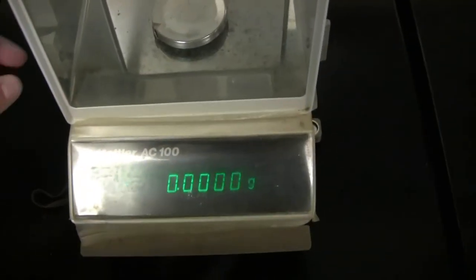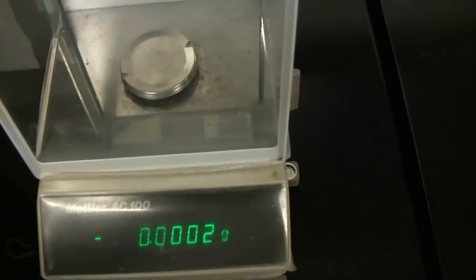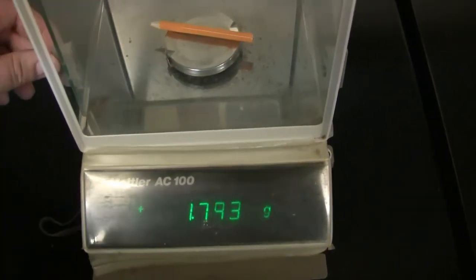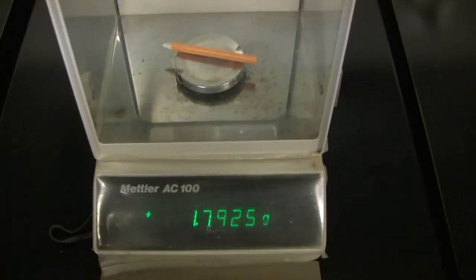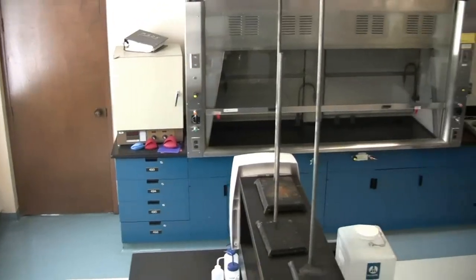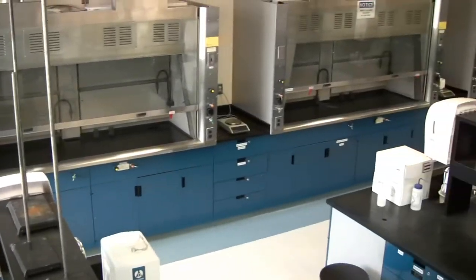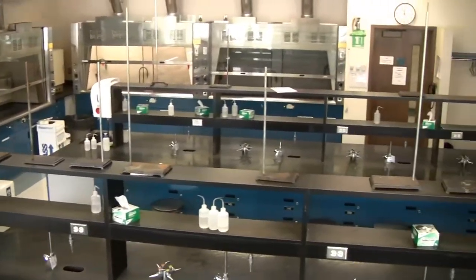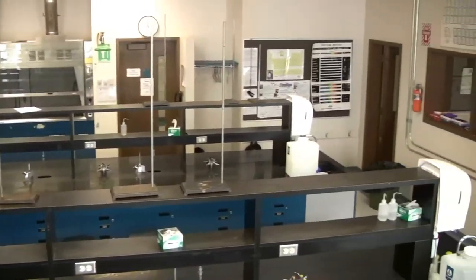In this room are the analytical balances, which are very precise measuring devices used to measure weight up to four decimal places. Fume hoods and top loading balances are located at the outer edge of the lab. Directly in the center are three identical rows containing similar equipment to the common drawers.